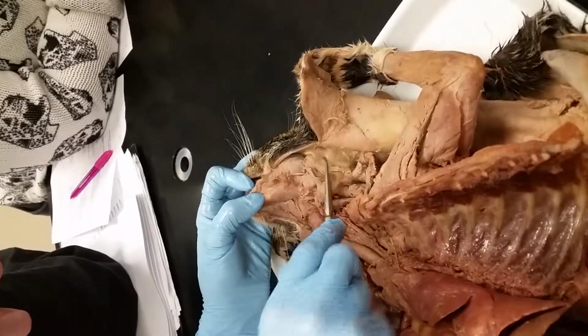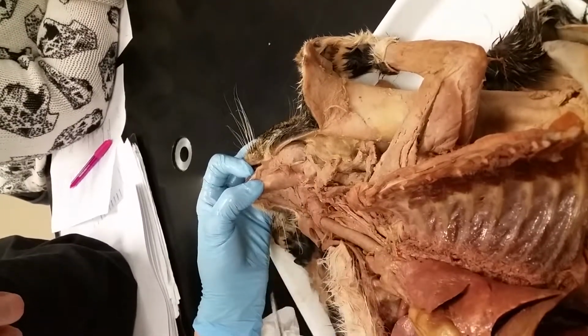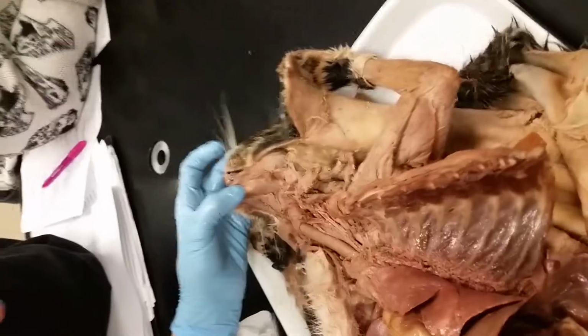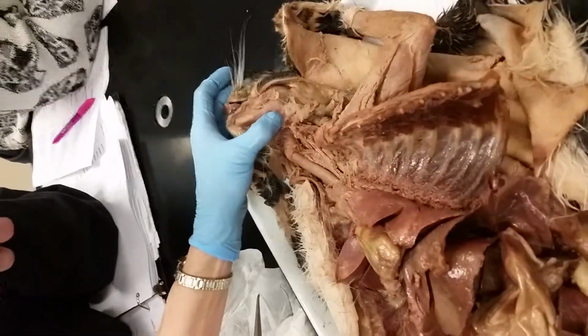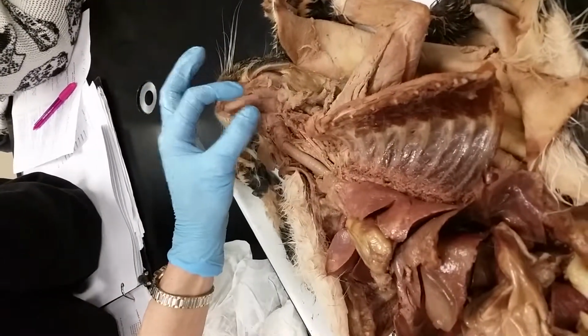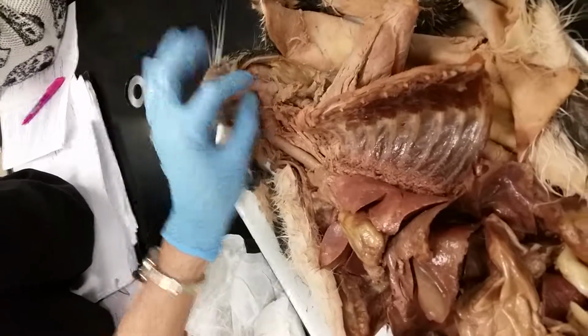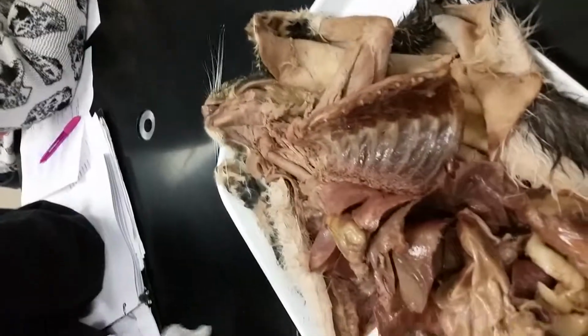Okay? But they will ask you parotid. They'll ask you a duct if we still have one intact by then, and the submandibular. Will they ask us the duct for the submandibular? Not usually, because we usually don't have a good duct left. If you do have it, it's very obvious. It's just a tube coming right off of there. It goes right up into the mouth. Okay? All right, so now we just need to do the pluck.